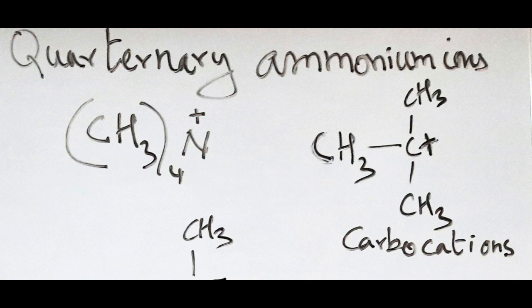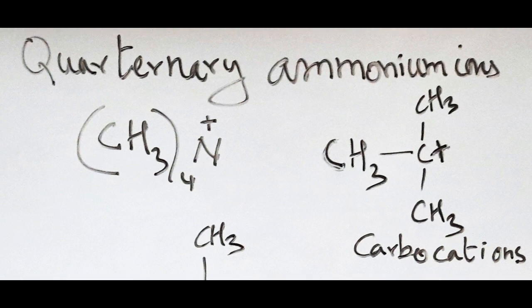Just like the silicon, which is electropositive, we have various organic compounds where the substituents, instead of having electronegativity, are having electropositivity. They are having the positive charge over them. For example, you have the quaternary ammonium ions, tetramethyl ammonium chloride. What about the chemical shift values of such compounds?